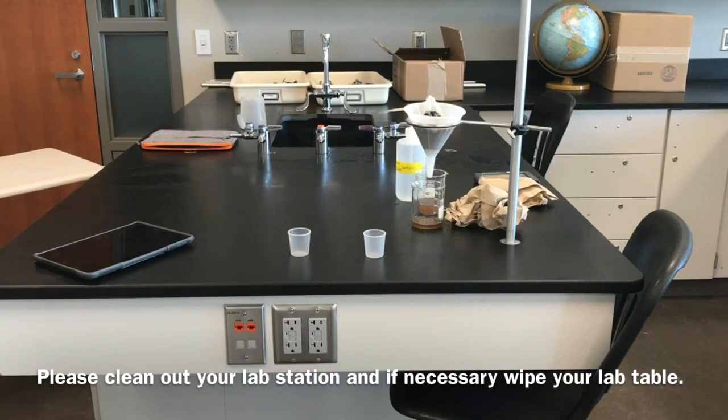And again, this is a very messy lab. It's probably one of the messier labs that we're going to run in this class. So make sure that you take some time at the end of lab here to clean off everything. If you spilled a little bit of acid or if anything else got spilled, make sure to wipe down your messes. We've got towels up in the front.